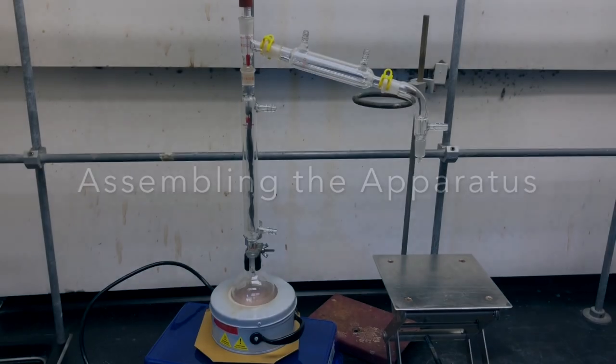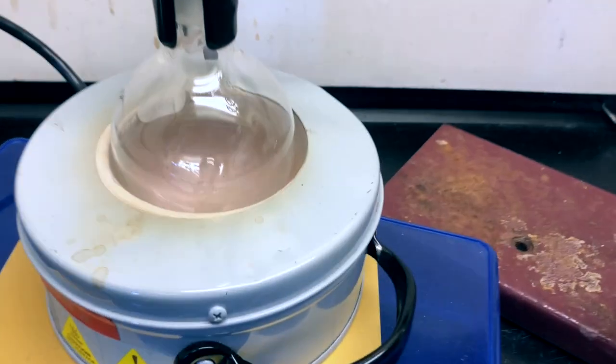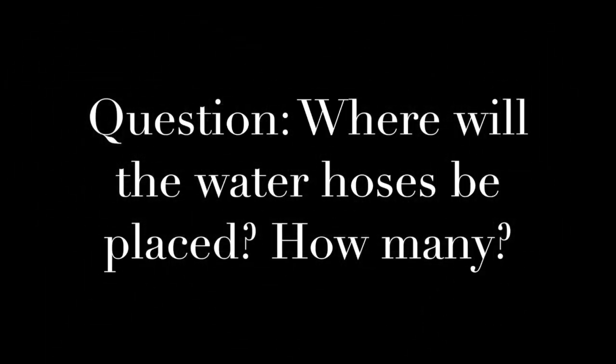Our apparatus now has a smaller boiling flask and a smaller ceramic heater due to having less than 100 milliliters of boiling liquid this time. We have packed the fractionating column with steel wool, placed our thermometer in the same way, and set up the condenser with an iron ring for support.